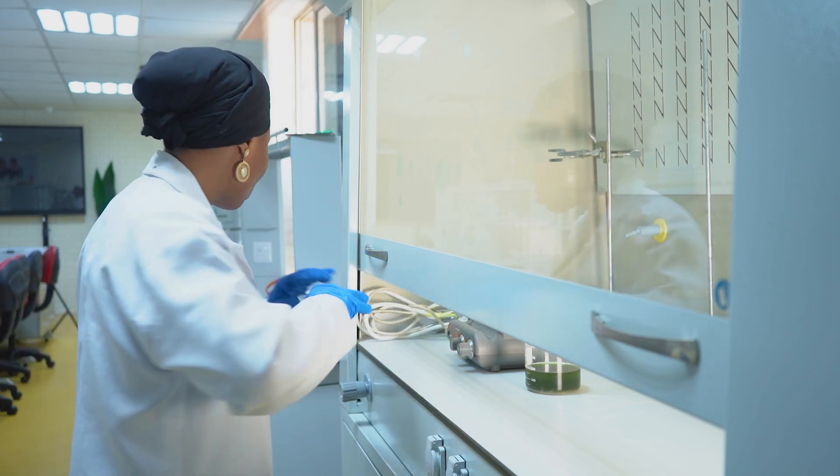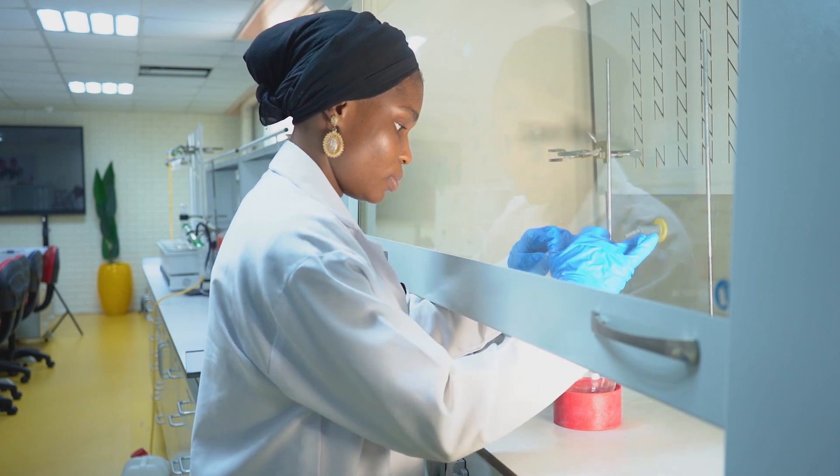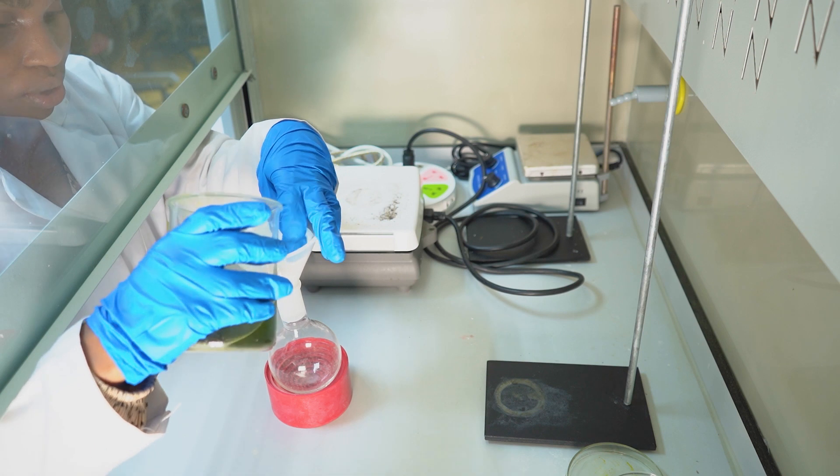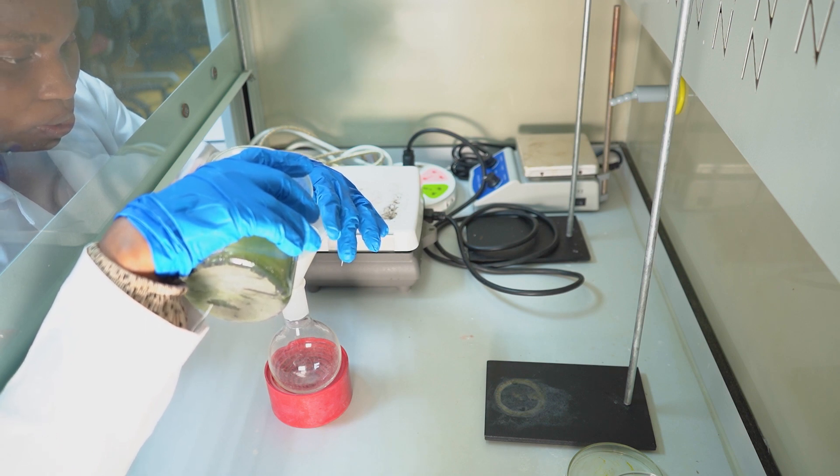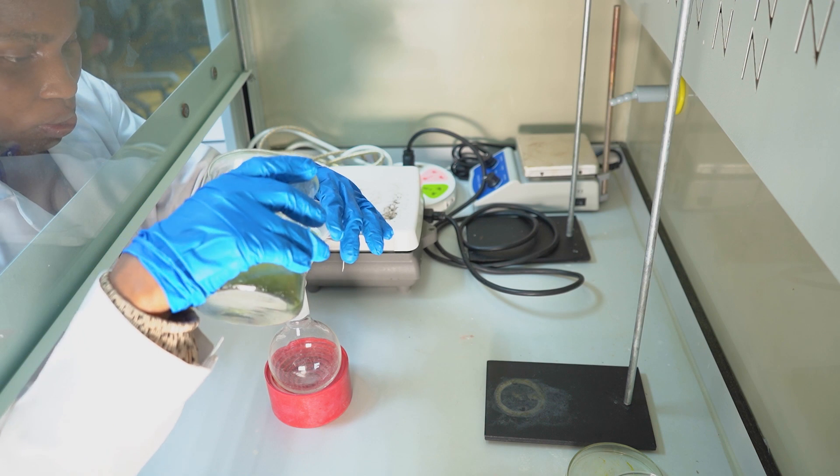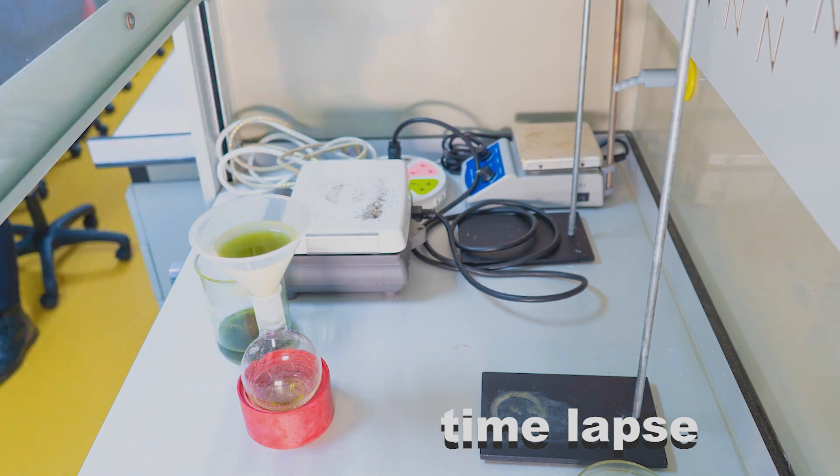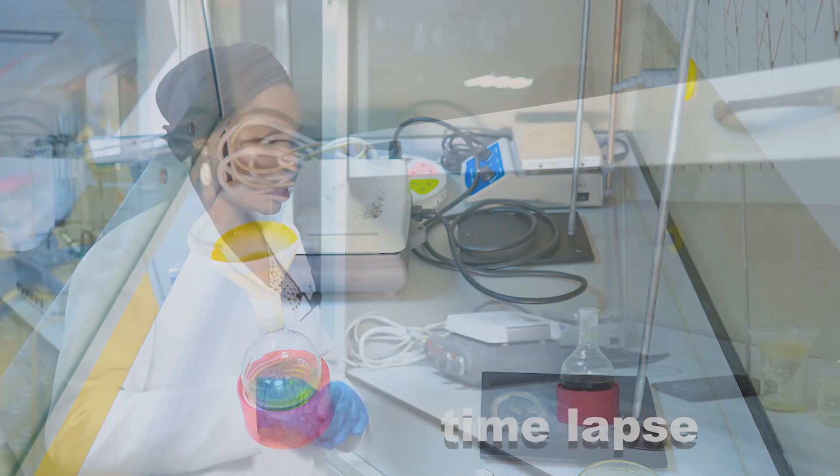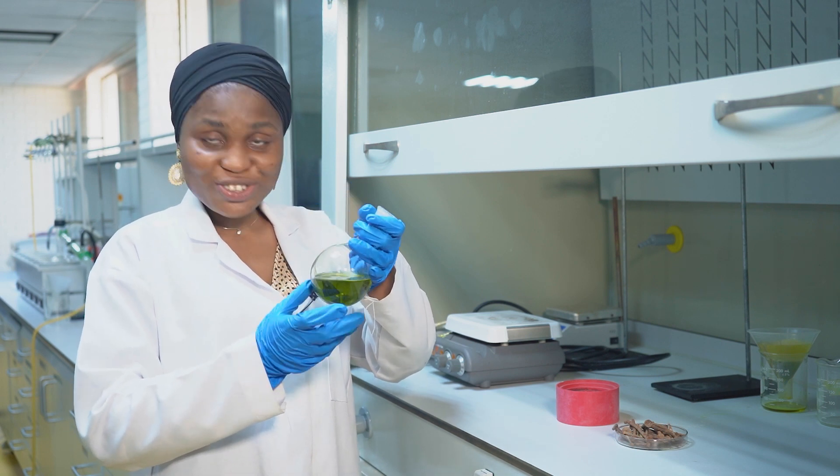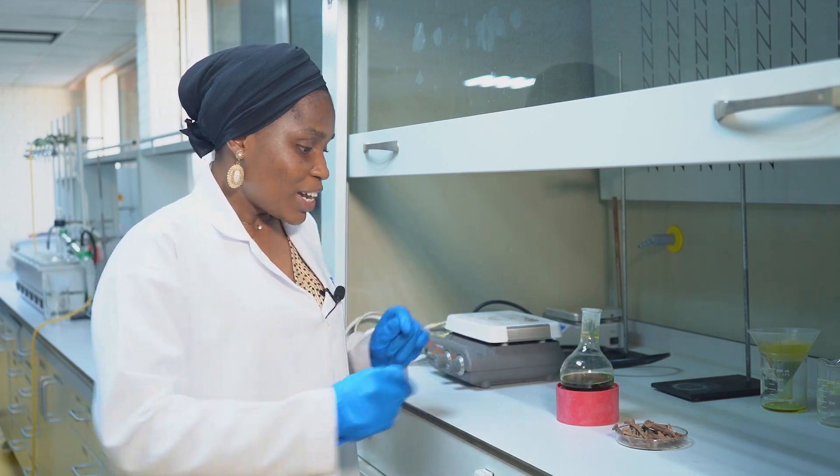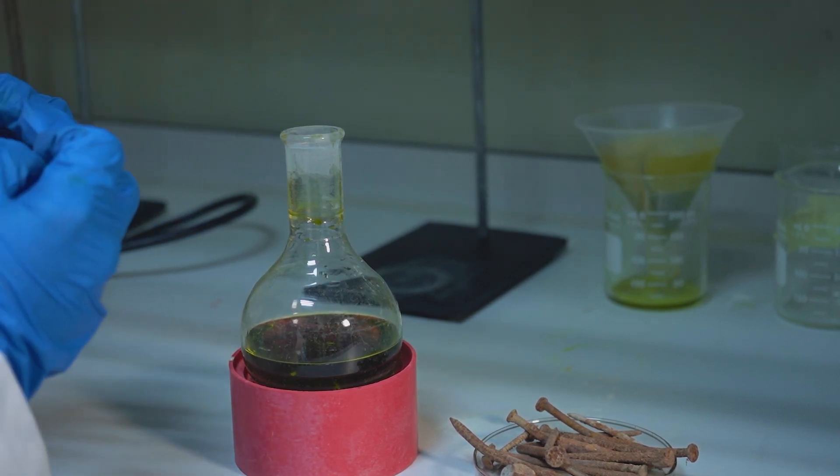So I'll be filtering it into the round bottom flask. This is the solution we obtained after the filtration process, a very nice greenish solution. So I'll be adding just two pieces of rusted nails to it.